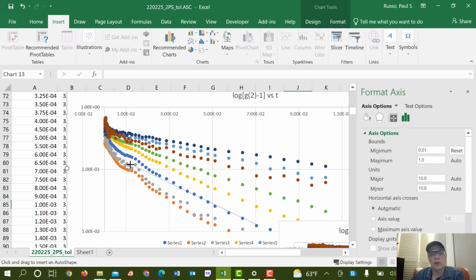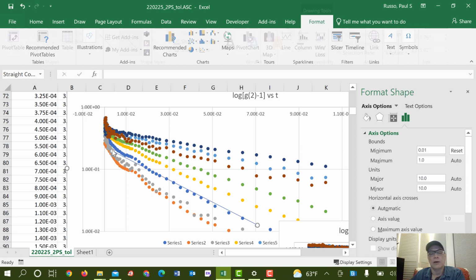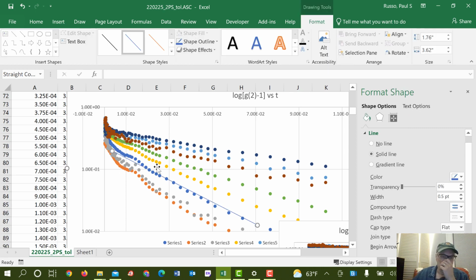So we think that a single exponential is not going to work, or at least it's going to miss some of the channels. It might work at some of these, this part out here where the bigger, slower stuff is that is actually reasonably linear. I could probably do a decent line for some of it. Let's take this top one here. That's the top one, slowest decaying, must be the lowest angle.